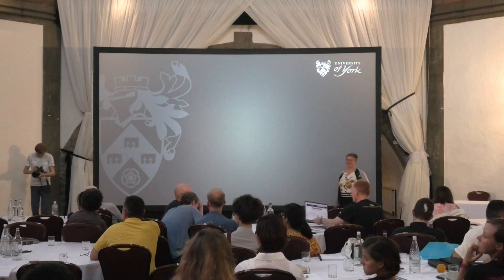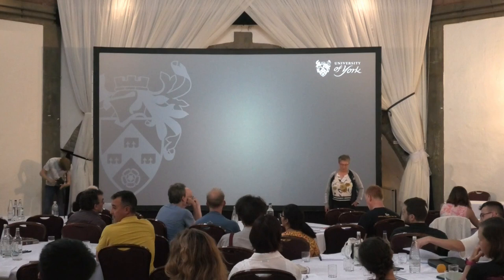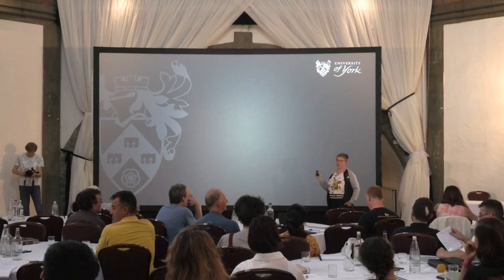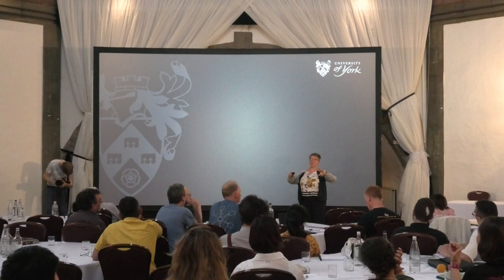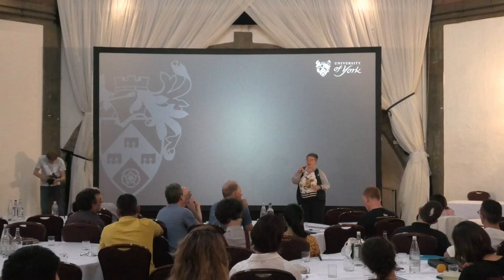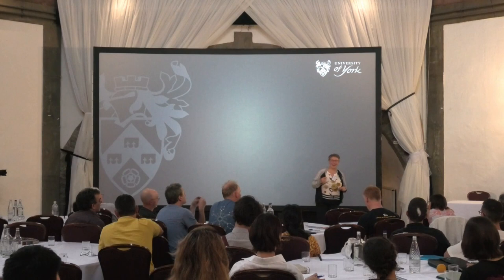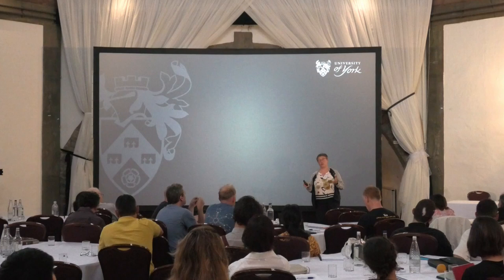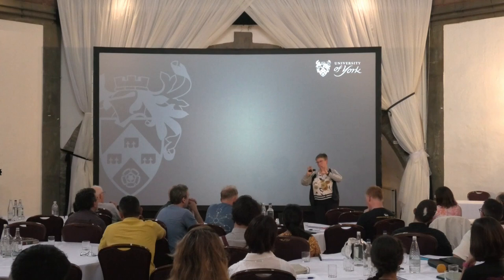Thank you. Have you tried to plot the distribution of the degree of completeness of your particles, to see if there is a solid angle that is open? Yeah, so Tibor has been looking at that. I don't have the results here to show you, but the most common incomplete form appears to be that we have effectively two of the fivefold missing, and then there's an additional pair of spikes sitting between those, and they are actually lying down. And in the mature form, we see something similar. When we see particles which have a complete membrane, and there's something missing, it seems to be two pentons again. And that's without applying any symmetry.